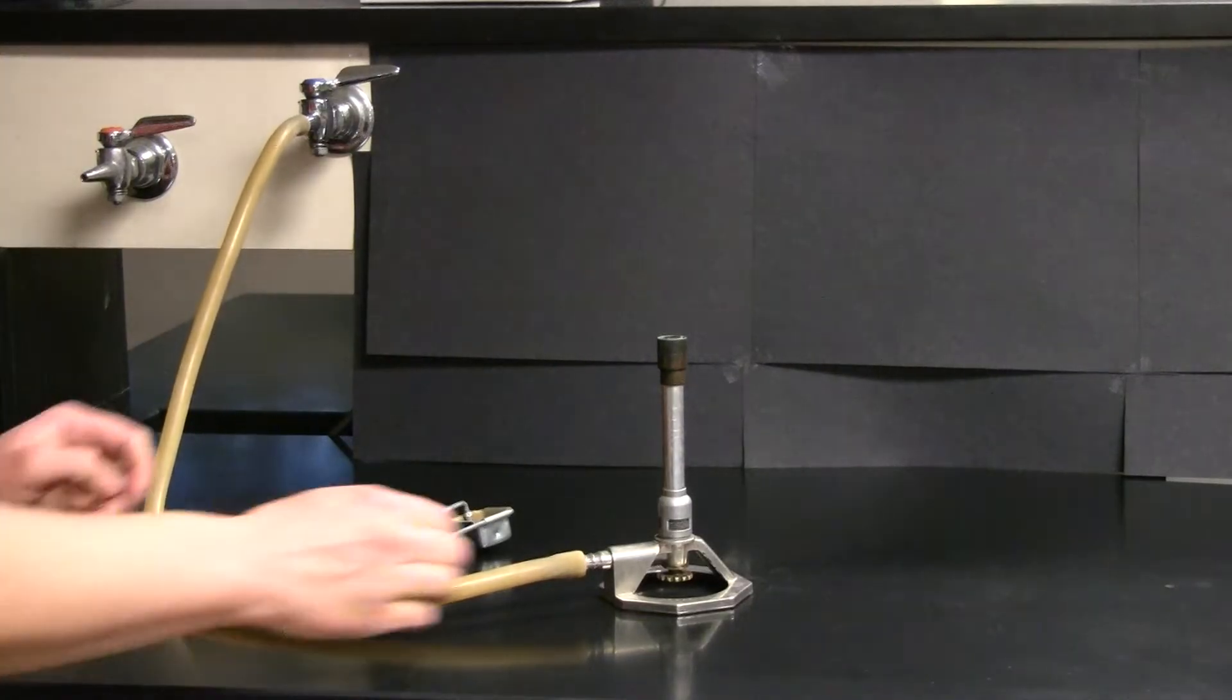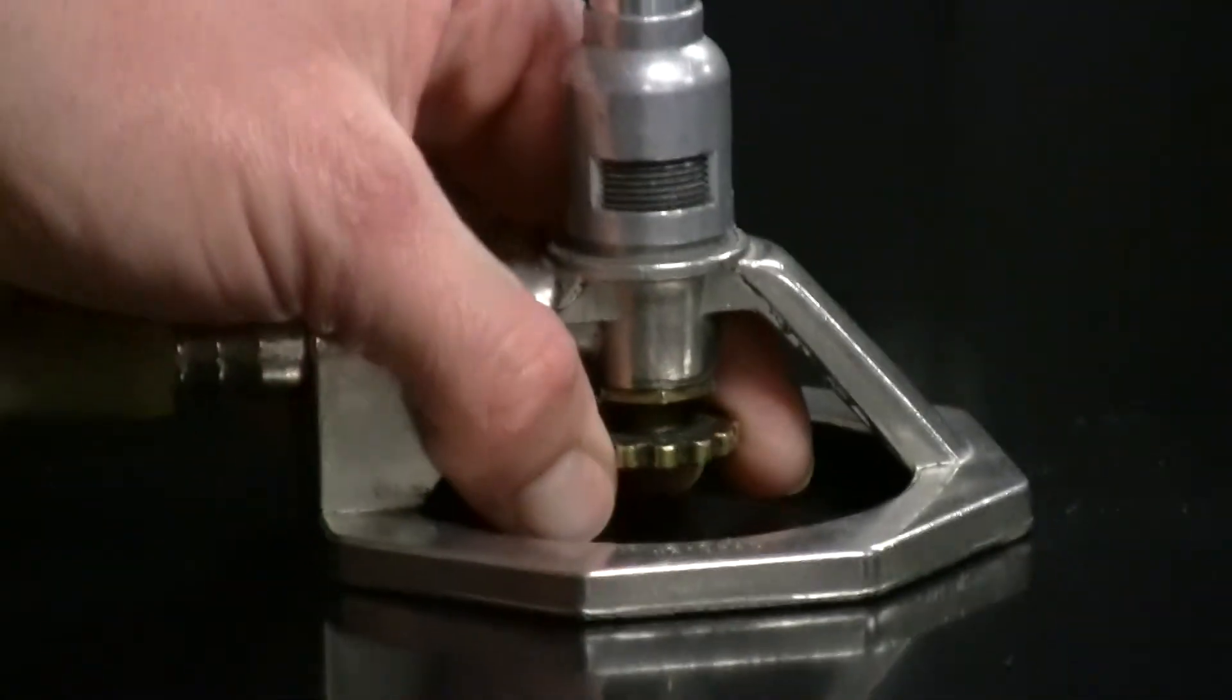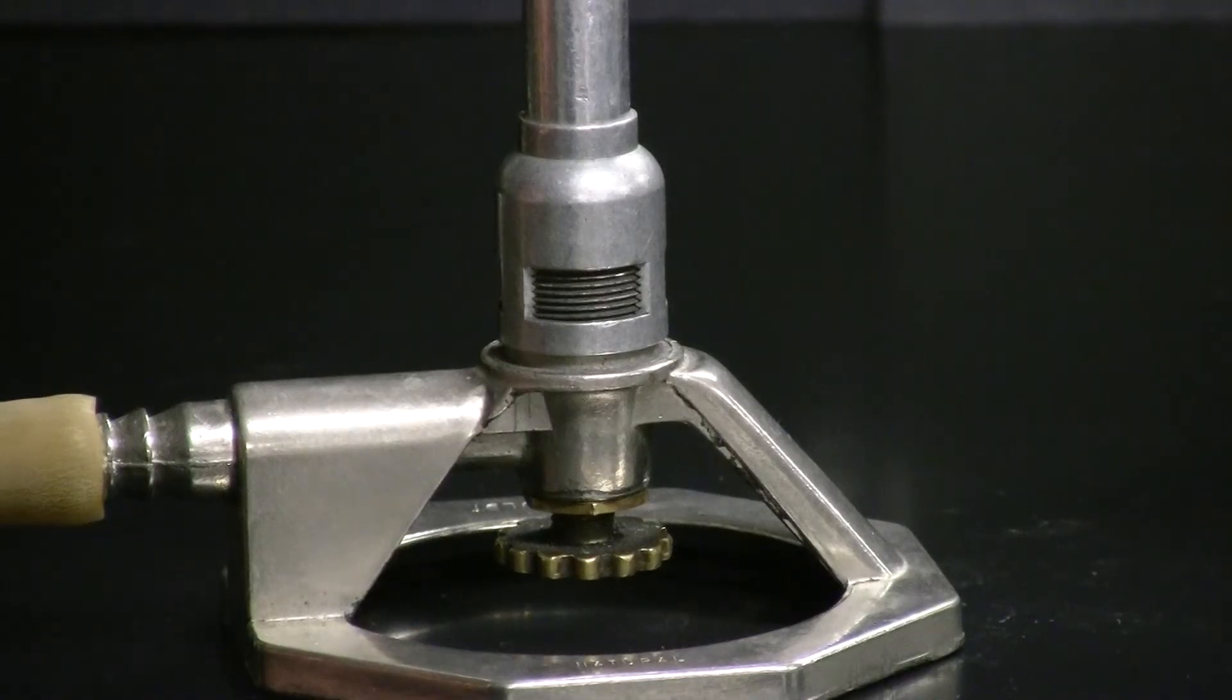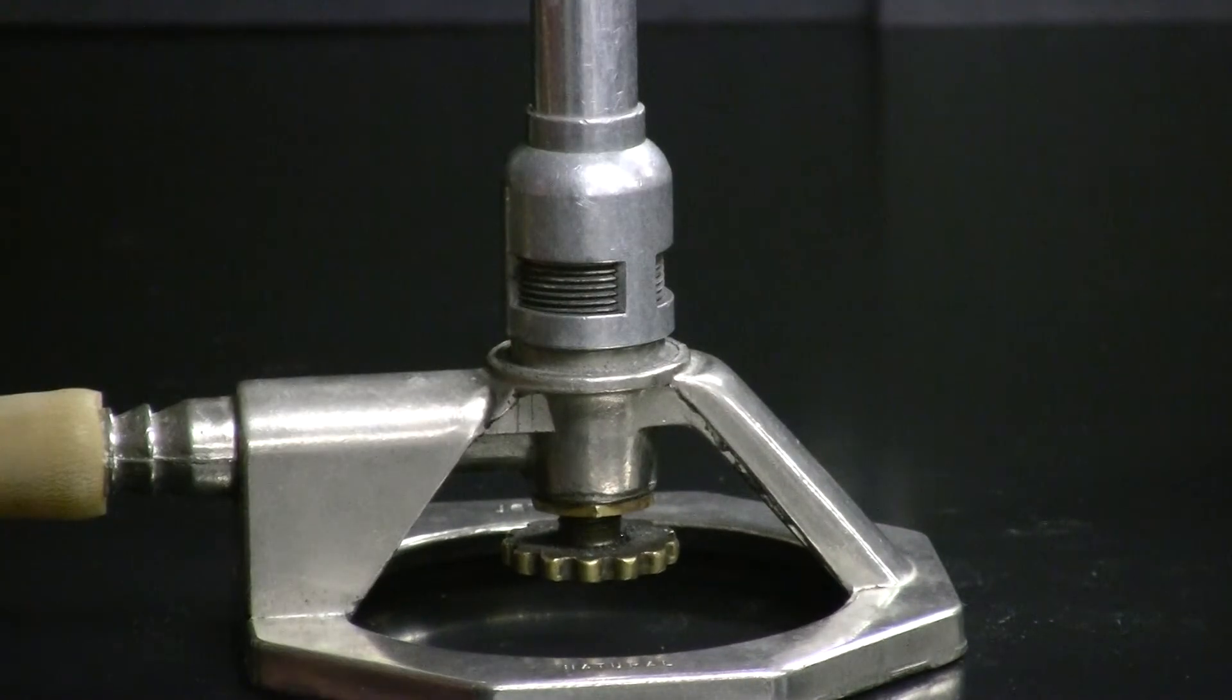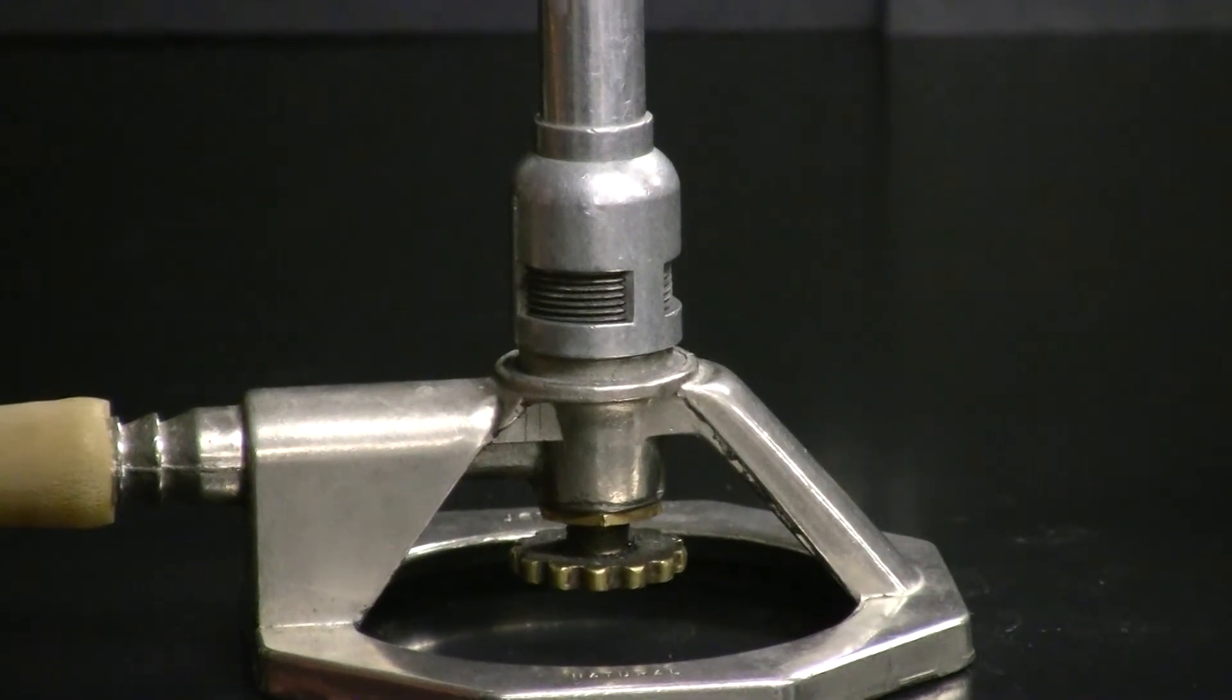Adjust your Bunsen burner by opening the gas valve about one full turn. Lefty loosey, righty tighty. You also want to open the air inlet valve about one full turn. Now turn on the gas at the bench top. Again, make sure that it is open all the way.